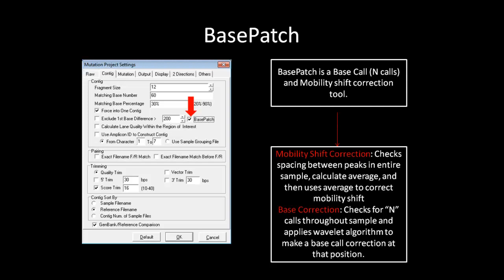This is particularly useful when you are trying to analyze mutation calls made at the beginning of the traces, where there are many mobility and base call problems.